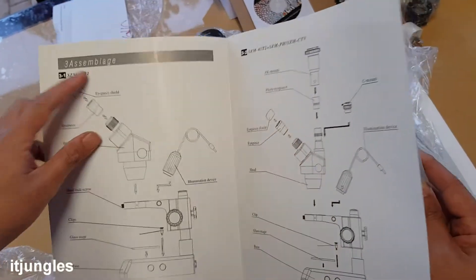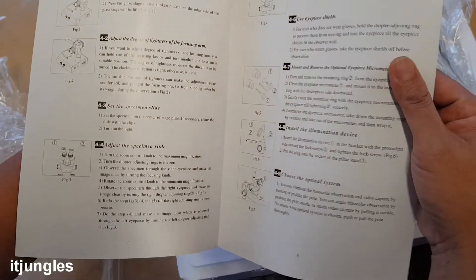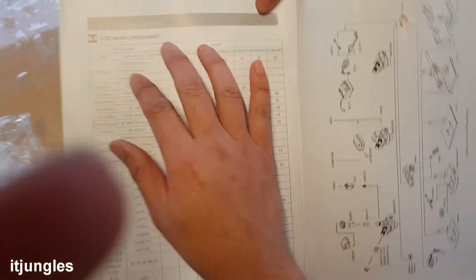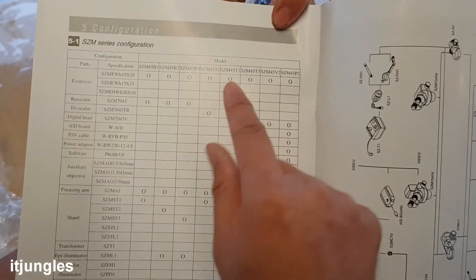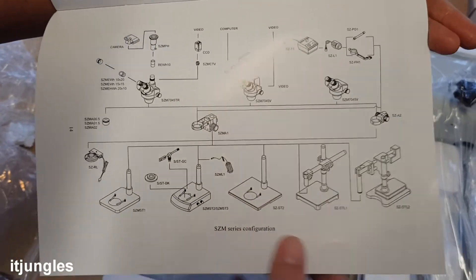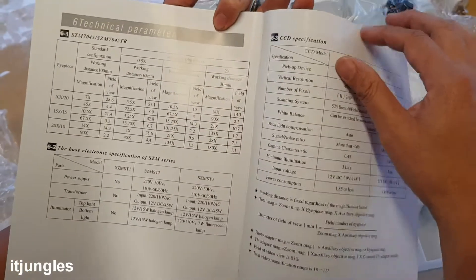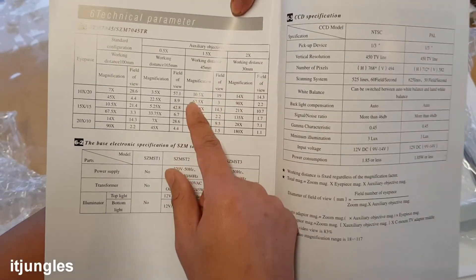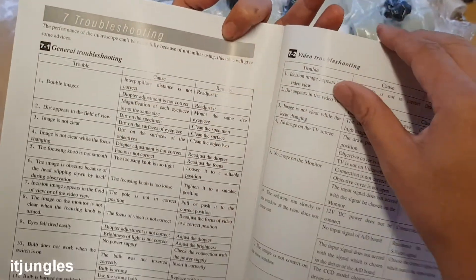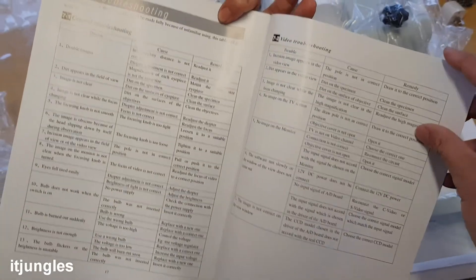Under operations, once you assemble the device following the instructions, there are operating procedures you can follow to learn how to use it. There are quite a lot of instructions on how to operate this microscope. There is also a configuration page so you can configure based on your model. It shows all the different pieces and configurations for the SZM series. Finally, there is a troubleshooting guide — if something goes wrong after assembly, you can follow it to correct the issue. And that's everything inside this box.